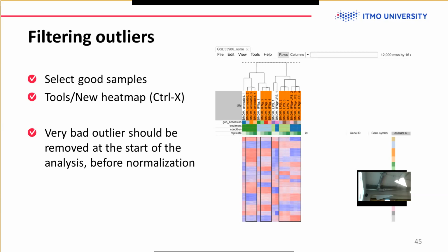For mice work, mice are genetically identical, so they are biologically very robust. It's not like human samples that are very different from each other. So you don't need that many replicates, and 3 replicates is enough for really powerful analysis.